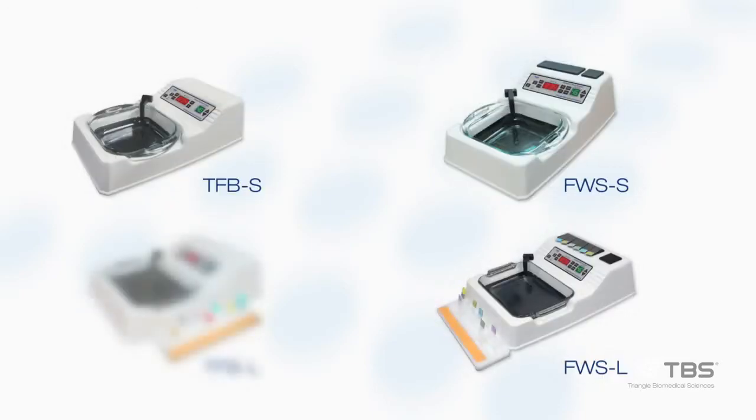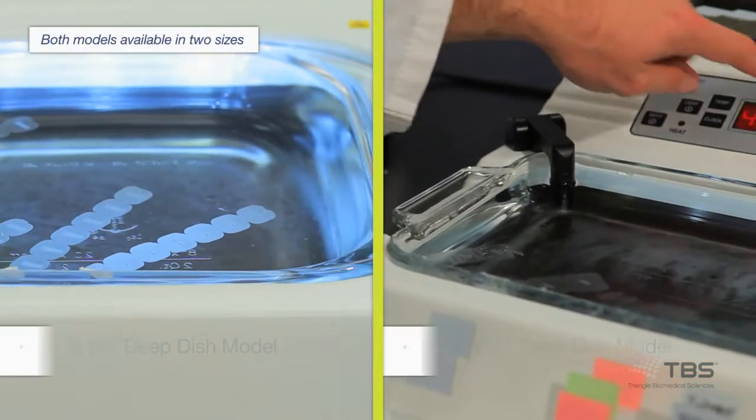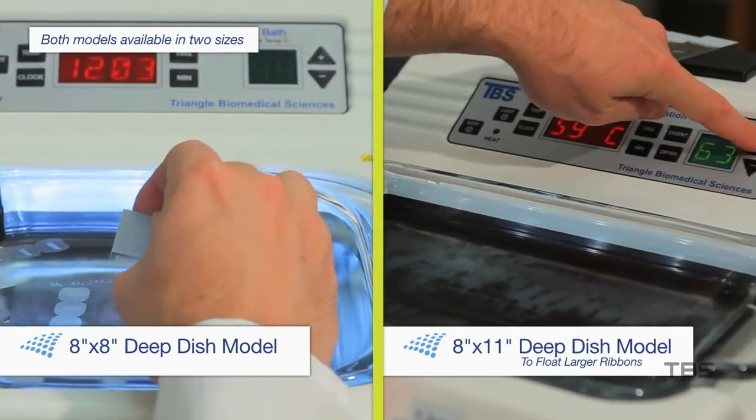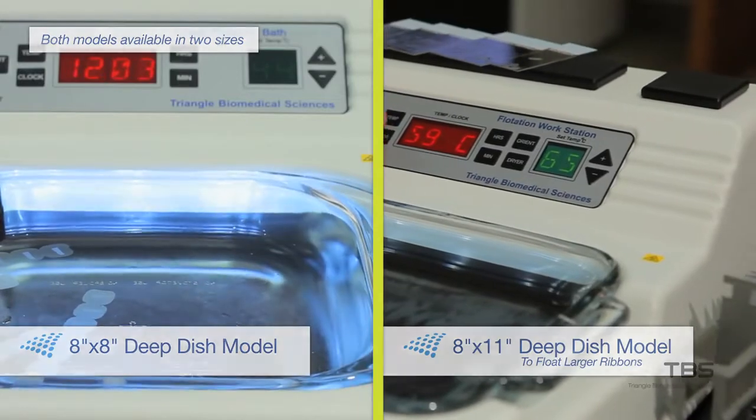TBS water baths are available in two different models, each of which is offered in two sizes. A deep dish model provides extra depth to lift the section out of the bath with minimal water carryover, and the 8x11 version provides efficient management of longer ribbons.